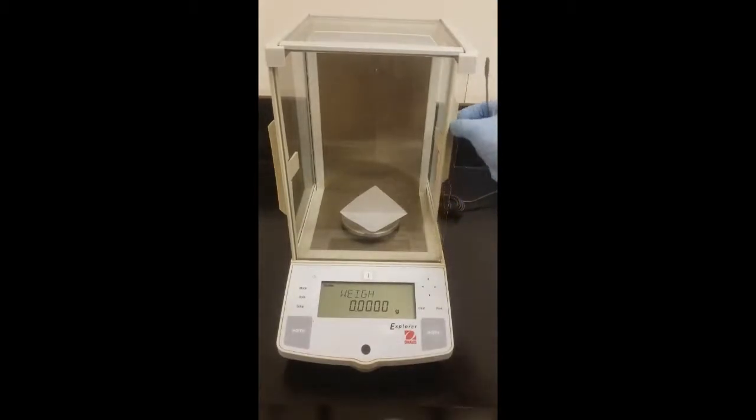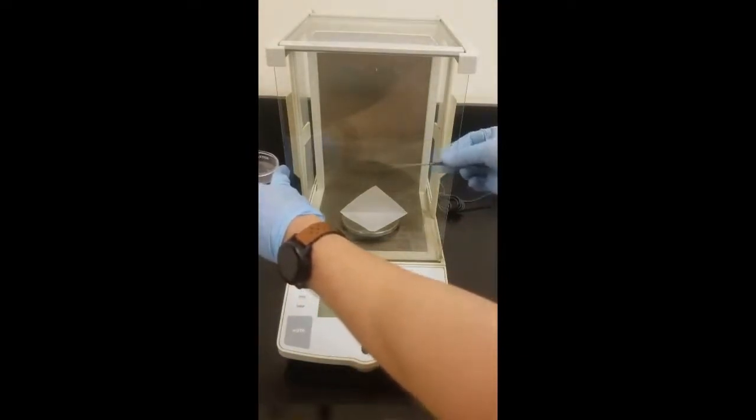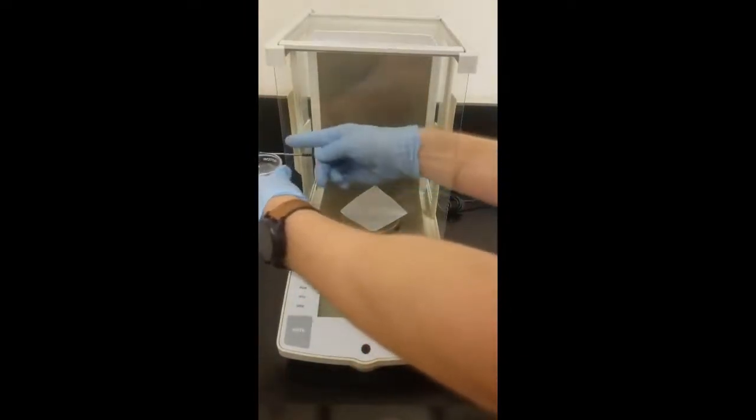So I'm going to use proper weighing technique. I'm going to open both sides. And then I'll have my chemical in one hand and my micro spatula in the other, and pour some out until I get about 50 milligrams. Probably a bit much there.